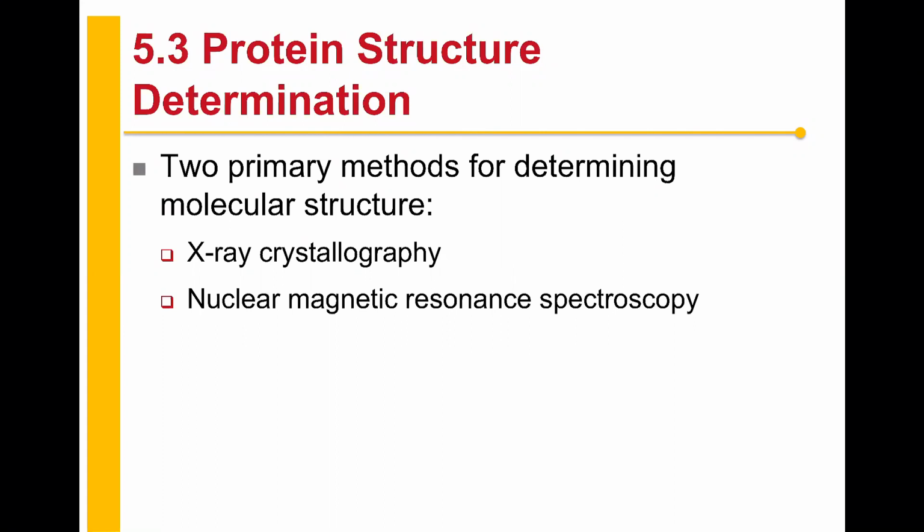So we're going to first talk about X-ray crystallography, and X-ray crystallography really started in 1957, so quite a long time ago. Its basic setup is that you shoot X-rays at your protein crystallization, and you can look at how those X-rays are diffracted, their intensity and their direction, and then you can use that to determine the three-dimensional distribution of electron density in your protein's atoms. So you get basically a snapshot in time of your protein structure, because your protein is in a crystal, in a solid lattice shape, so you get one structure.